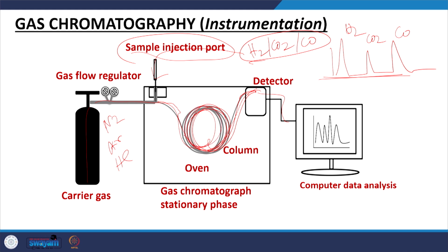So, this is actually like a running track. If the 3 components start running from here, due to their polarity, non-polarity, and molecular weights, their velocities would be different, like on a running track. If 3 different people want to complete a 100-meter run, they reach the destination at 3 different times. Like this, here it would reach at 5 seconds, 10 seconds and 15 seconds. So, 3 molecules take different times to cover the same distance from here to here.